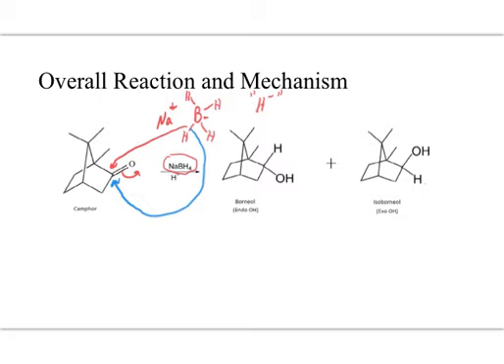We wind up with BH3 as the byproduct. It can still act as a reducing agent, so this could also deliver hydride as well. So the number of equivalents that we could actually get from this, there's 4 hydrogen atoms to deliver. You should look at your stoichiometry, how many moles of borohydride are we using, and how many equivalents are we actually using in this, if all of them could be delivered as an H minus equivalent. You should think about that. You should also think about which isomer is going to be preferred in this.